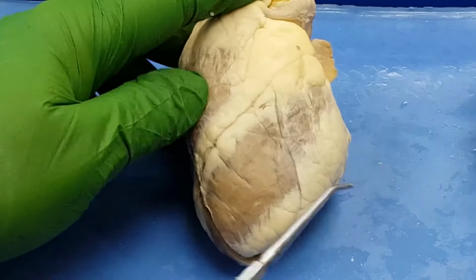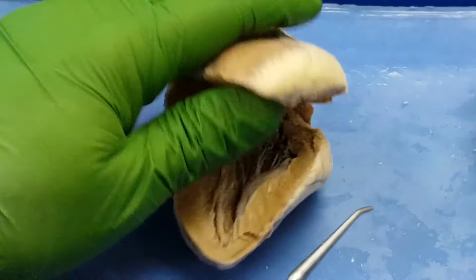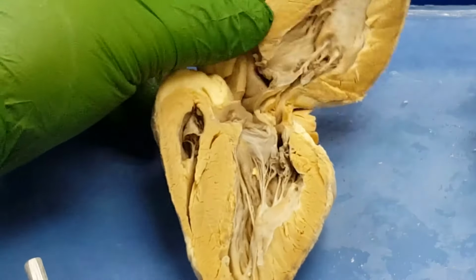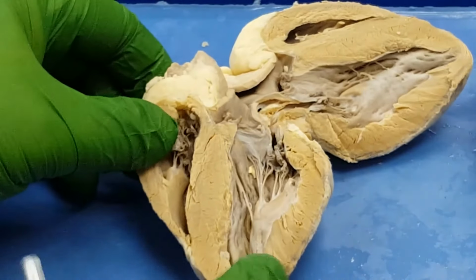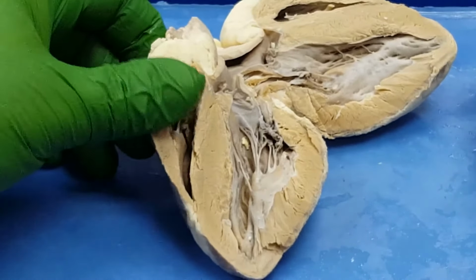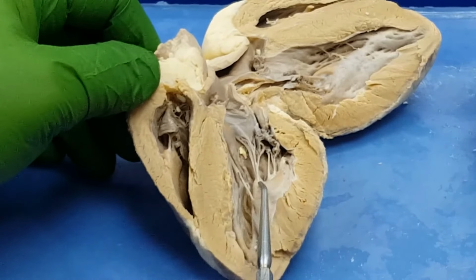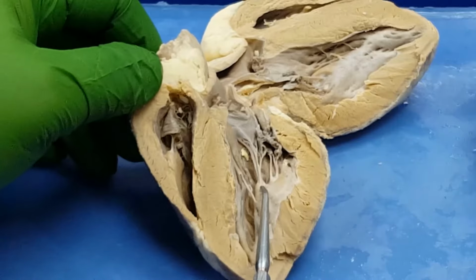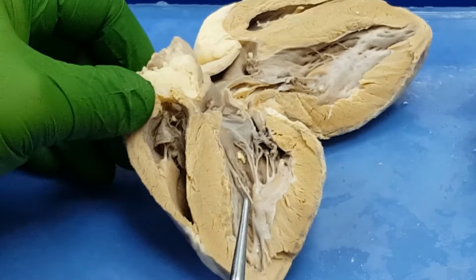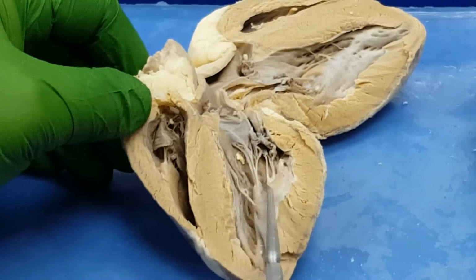So here we have my preferred method of sheep heart dissection, which is just a cut down the front of the heart, actually up the heart, so it opens in this fashion, sort of like the hood of a car. And I can see quite obviously right off the bat the two ventricles. I always look at the heart this way to orient myself. I can tell this is the left ventricle.